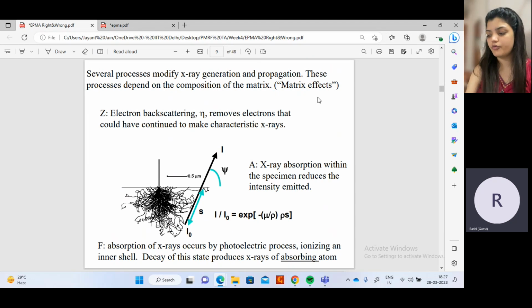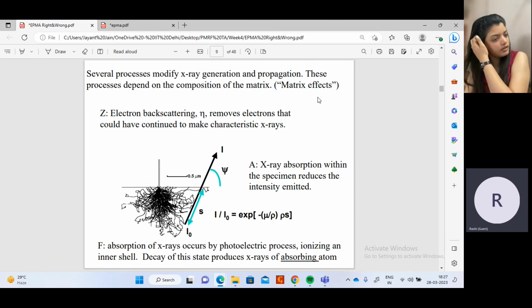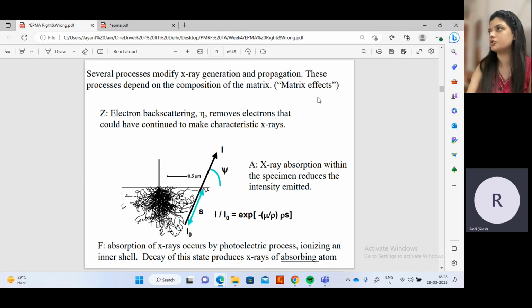So the concept of how the X-rays are produced and then the wavelength is measured, the detector will be different. Just the wavelength is measured rather than the energy. But the concept of how the X-rays are emitted is just the same as how we do it in FESEM.